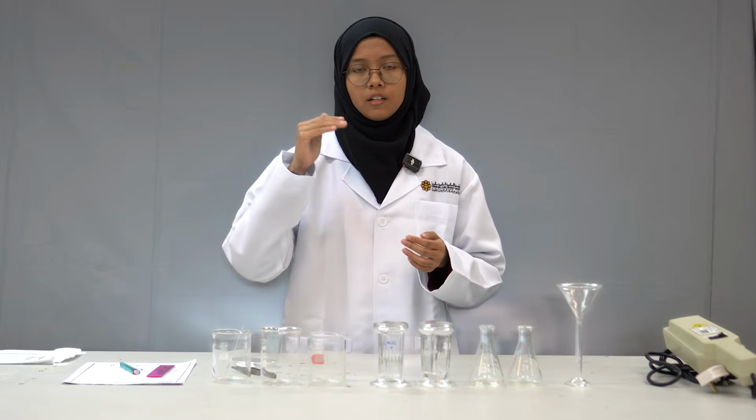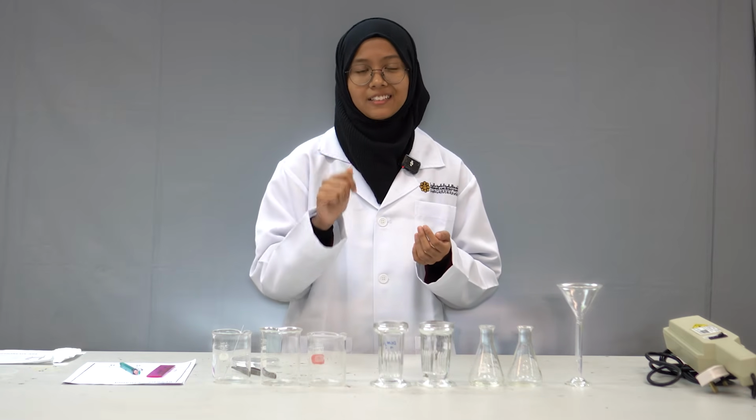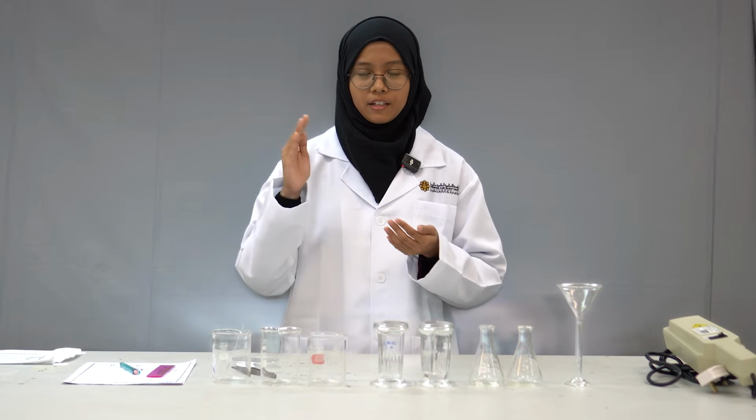When there is more interaction, it will migrate more slowly on the plate. The opposite: the less polar the compound, the weaker the interaction between the compound and the stationary phase, so it will migrate fastest and the distance will be higher.